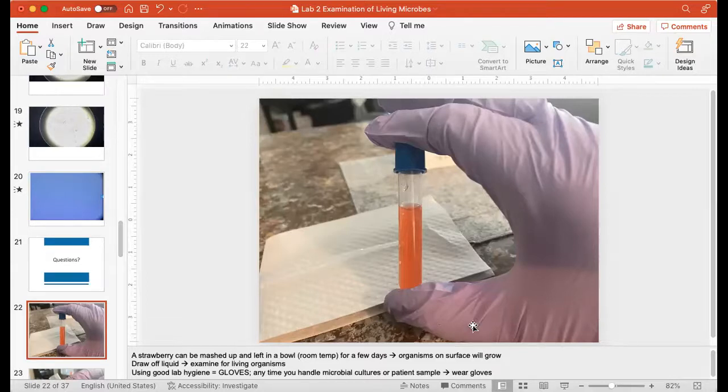These gloves don't fit me. When you wear gloves in the laboratory, the glove should fit in a way that is close to your skin, but not tight. This glove is a little bit too big for me. All these wrinkles that you can see, there's a little extra room in the fingers. I would preferably use a glove that was one size smaller.